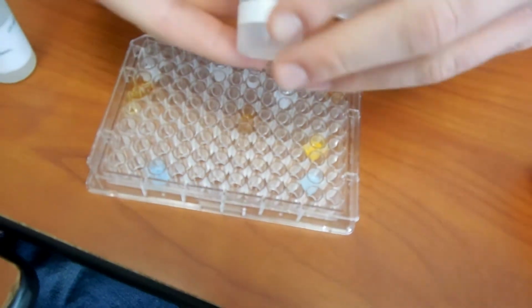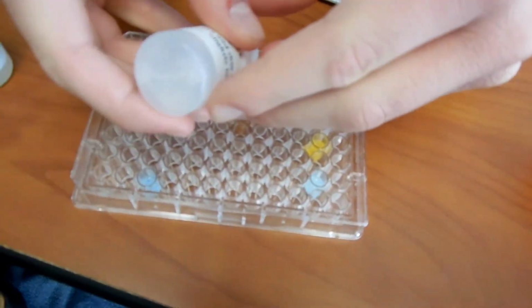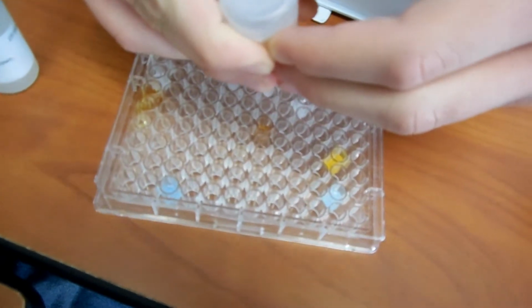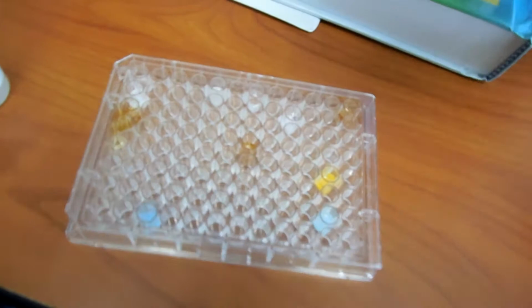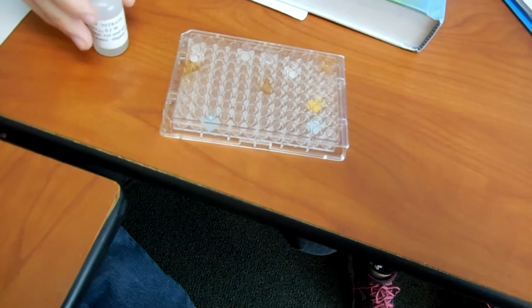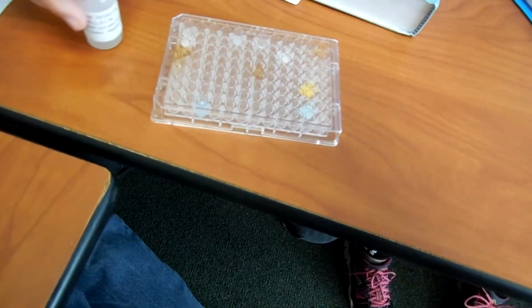Put one more drop and then go wash your hands. What is it? It's zinc. It's alright. Not a strong base. Not bad. Actually, zinc's really good for you during cold season, but probably zinc hydroxide's not the way to go. Then we put the right lids on, which is probably what happened down there last year. We probably put the wrong lids on.